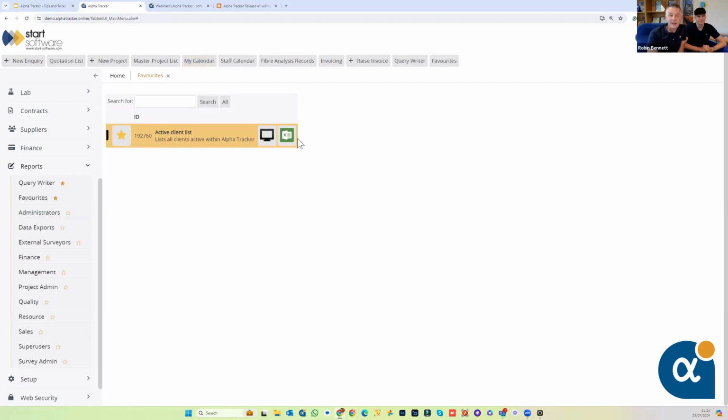Now, what I'm thinking, Dan, and we've had a little chat in the team at the design meeting, is that if there's a report in the system that you want to turn into a dashboard, there should be a calendar button here. You'd click that, it would ask you how often you wanted to run that, and it would then run it for you and email you the results. So you could say every Monday, 10 o'clock, or the first of the month, email me this report, and it will automatically run to save you having to do it manually. So yes, it's on our plan. It may even make it into release 41, but it was a last minute thing we were talking about at the design meeting.